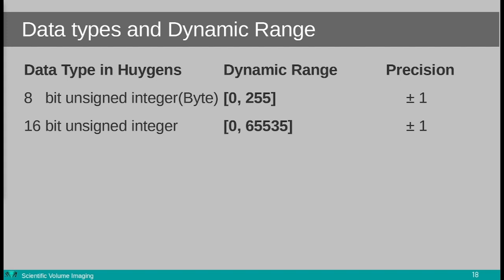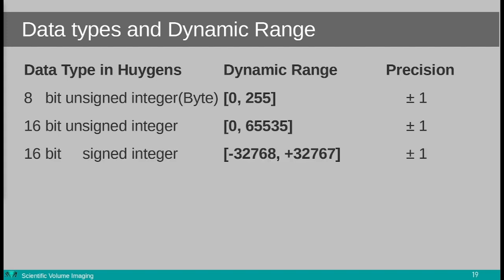But if you want to do some math for a specific analysis with these images, it might be necessary that you need to subtract images from each other. This could mean you end up with pixels where you would like to store them as negative numbers. And this is not possible in the unsigned integer case. For this, there is the data type called signed integers.